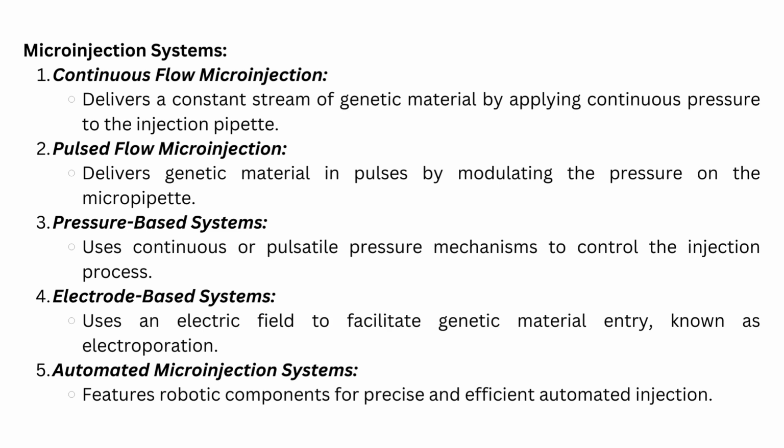Pressure-based systems. Uses continuous or pulsatile pressure mechanisms to control the injection process. Electrode-based systems. Uses an electric field to facilitate genetic material entry, known as electroporation. Automated microinjection systems. Features robotic components for precise and efficient automated injection.